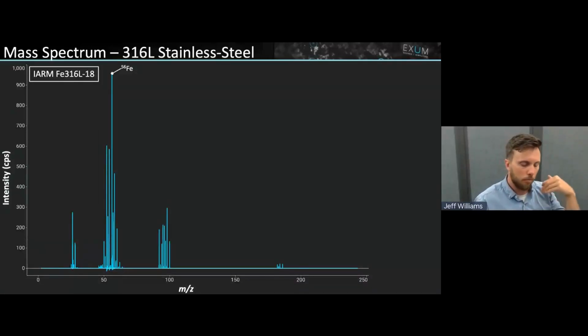One of the really important things when trying to create a new technology to, again, fundamentally change the experience of what it's like to use a mass spectrometer is that we needed to take away the algorithmic complexity and any sort of multivariate space. We needed this to be a very linear process where we could be the analytical chemist for our customers. All you need to do is choose the spots to analyze, press next, apply a calibration curve, and you're done. And if you have questions, please ask for clarity on some of the fundamentals in the Q&A session.